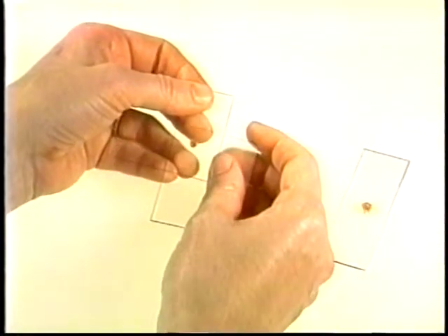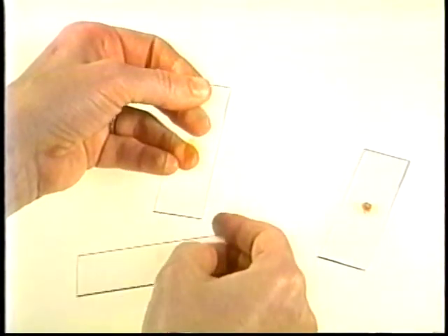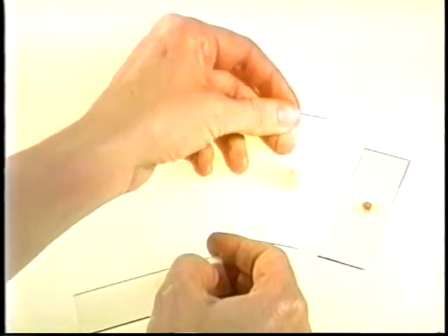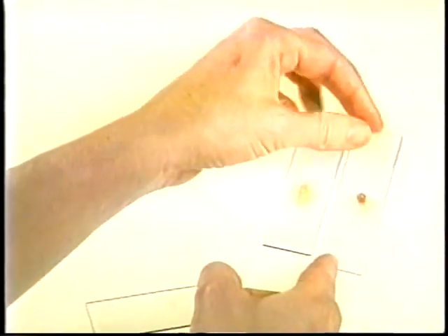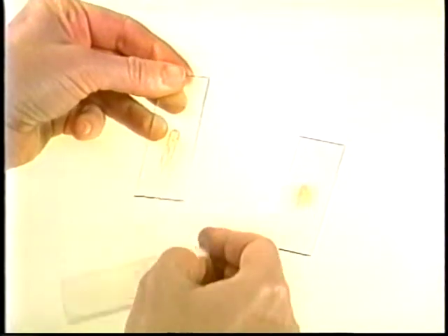Put the bottom slide aside. Pick up a fresh slide and smear the material. It does not matter that the harvest was on the top slide before smearing. The same basic technique can be used. Now, set aside the completed smear and pick up the original slide and smear the remaining harvest. If there is plenty of material, it can be subdivided several times. In this fashion, 2 or more smears can be made and several stains applied.